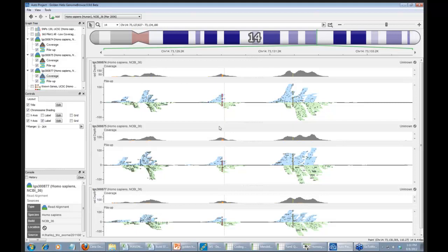You have the option to filter on different variables at different levels and see what those results are. We're still at the stage of trying to figure out the best way to analyze this data. I would love to get to a point where 100% of our candidates are real and we don't miss anything. I don't think we'll ever get that far, but I think we can probably boost it a little bit. That's a long answer to your question.